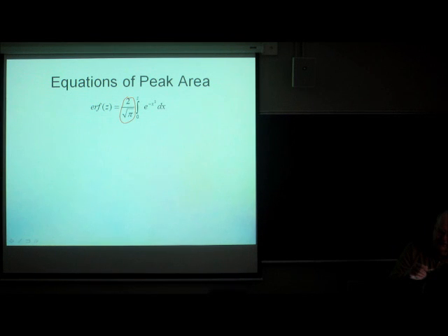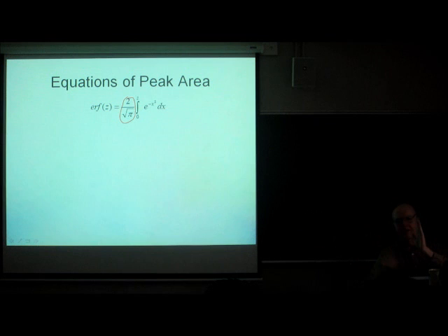So it's really the integral starting at the peak maximum, that's where z is equal to 0, and then out. Or it's the integral from 0 starting at the peak maximum and going backwards, going to minus z. But it's defined this way.